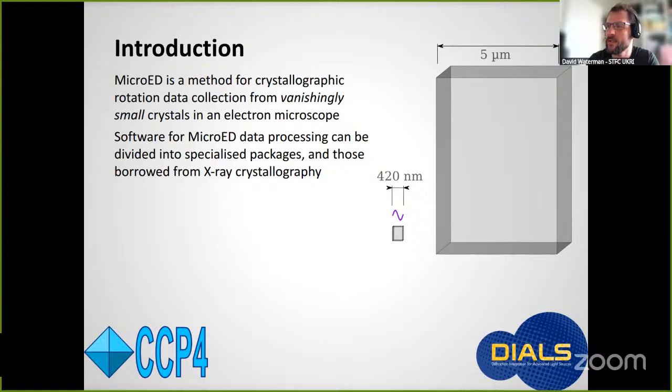A point that I wanted to make about the software for MicroED is that we can split the software into packages that are specialized for the method and those that we've borrowed from X-ray crystallography. This is a consequence of the fact that the fields have developed quite independently over the past few decades, and the software development reflects that.